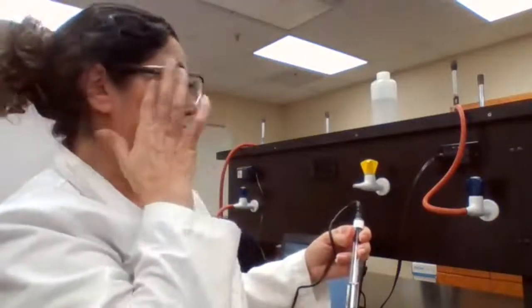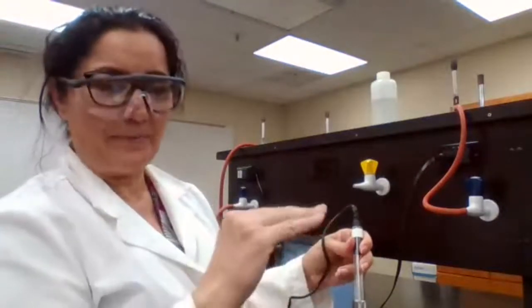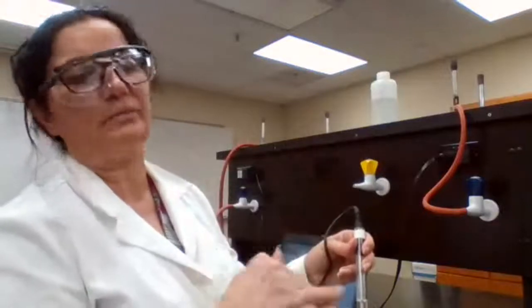That is, at what temperature the 2 gram is going to dissolve in 5 milliliter, which is a solubility of 40 gram per 100 gram, and we are trying to experiment that temperature. We want to know at what temperature it's going to dissolve completely. So that's the cutoff temperature, basically. Any temperature higher than that, it would be dissolved. Any temperature lower than that, it will not be dissolved. So it was a good question, but that's the whole point of this experiment.